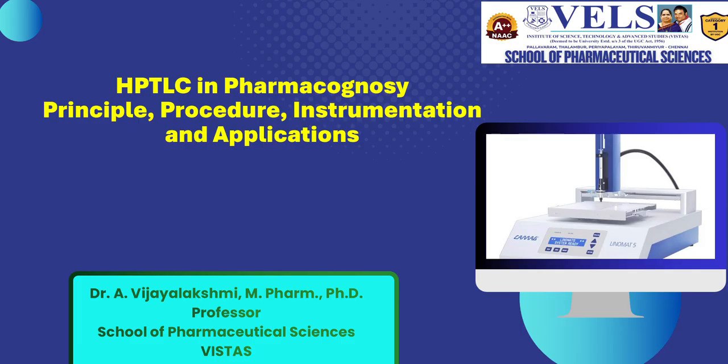In this session, you will understand the principle of HPTLC, instrumentation, and step-by-step procedure from sample application till analysis of the phytoconstituents.